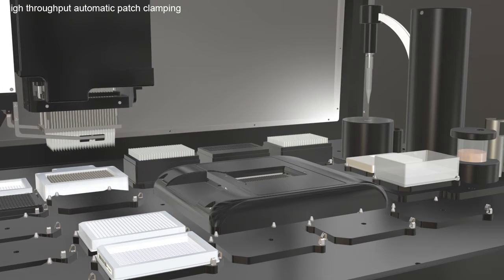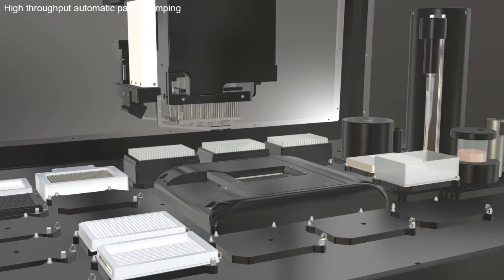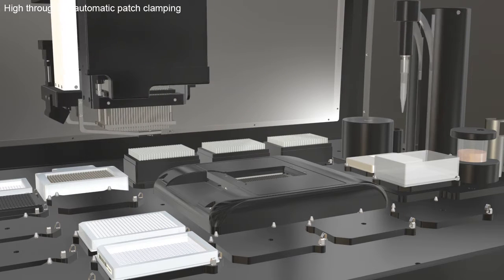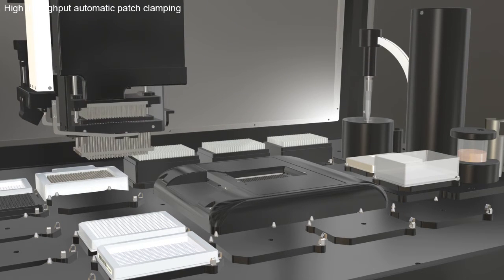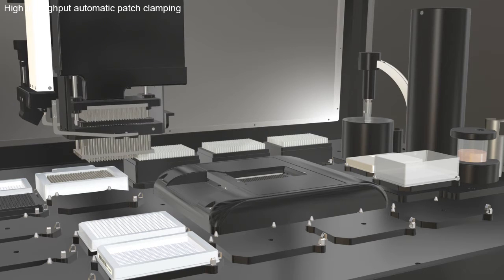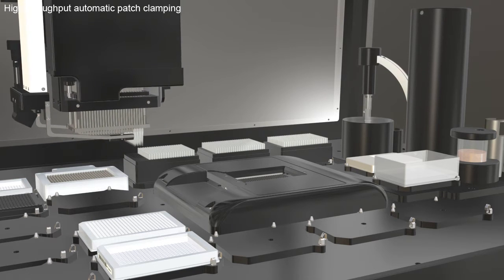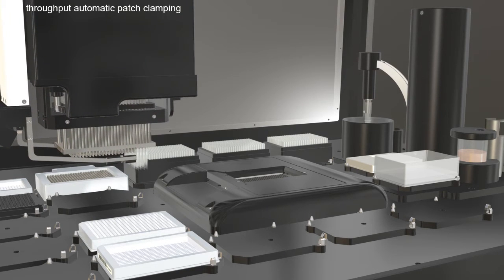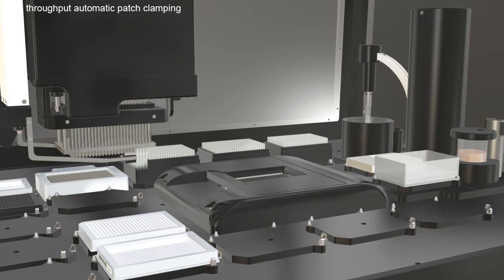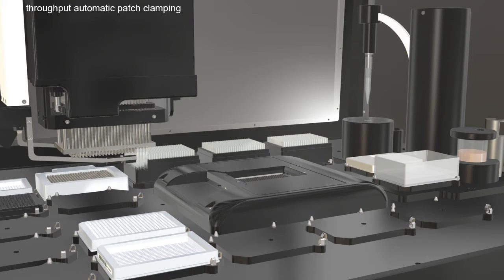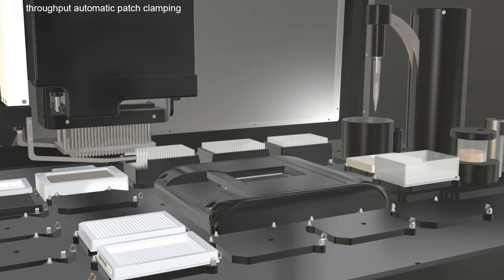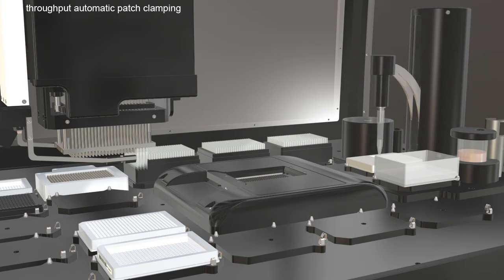One pair is found in each well of the consumable and are electrochemically stable throughout the experiment. Meanwhile, the ACP has prepared the cells and these are now picked up by the pipetter and dispensed into the Q-Chip.